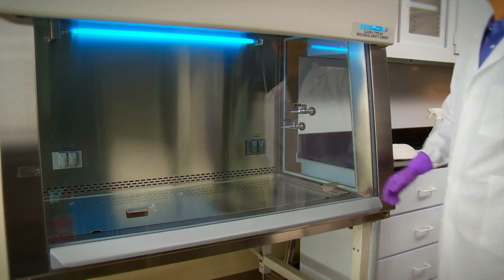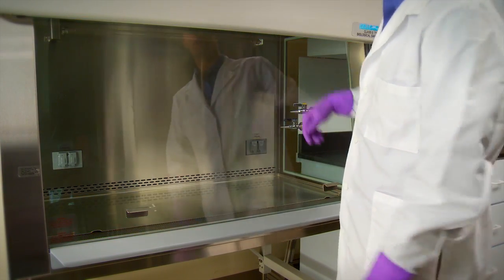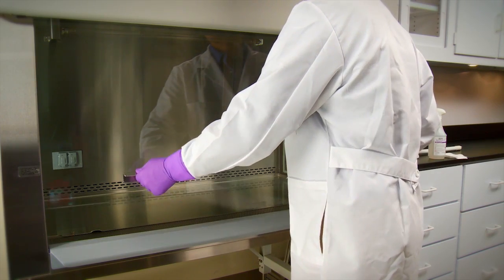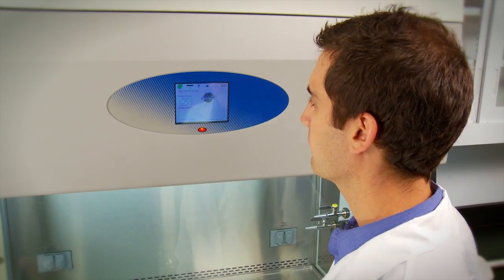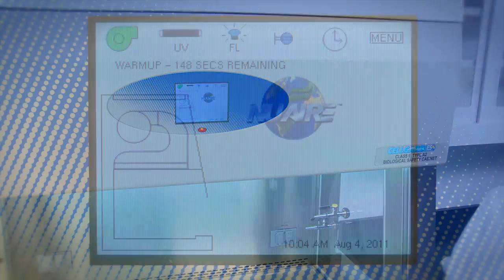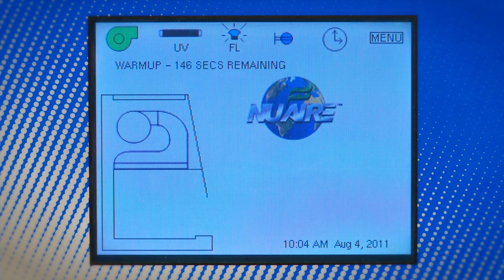There's more to safely turning on your BSC than simply flipping a switch. Cabinet blowers should be operated at least three to five minutes before beginning work to allow the cabinet to purge. This purge will remove any particulates in the cabinet.